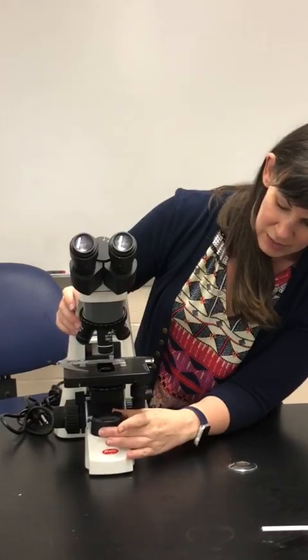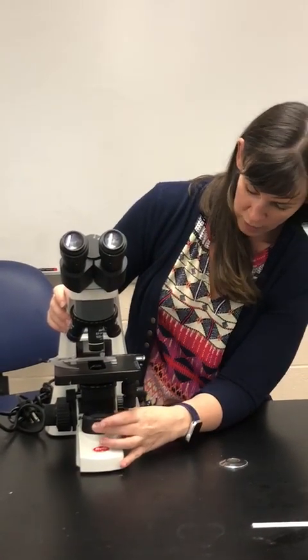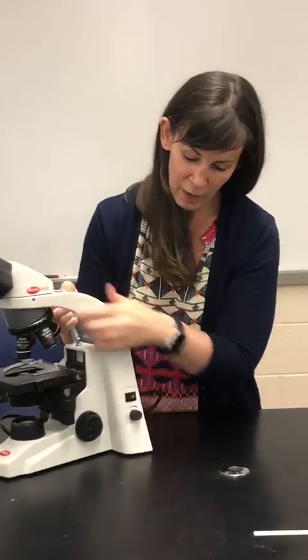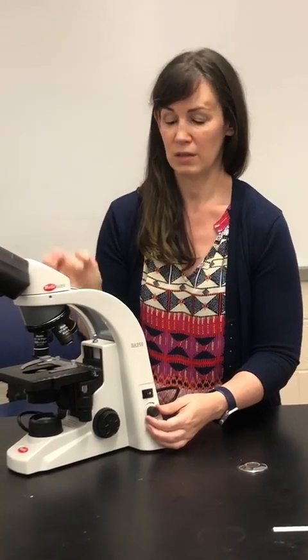Below the condenser is our lamp, or an illuminator. This is where the actual light comes from. And over here we have a knob that can control the brightness of that light. Anytime you want less light to come through your specimen, maybe it's just too much for your eyes, you always want to adjust the light here, not with the condenser, because that's going to affect what things look like, not just the light, okay?